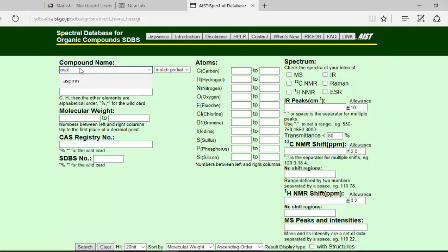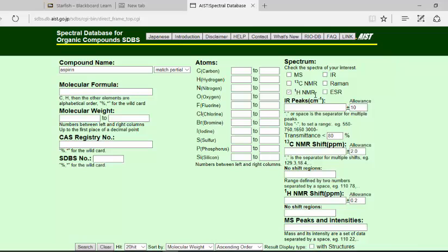So let's say we want to find a proton NMR for aspirin. So you type that name in and then you can click here H1 NMR and that would be the proton, and let's search it and see what we get.